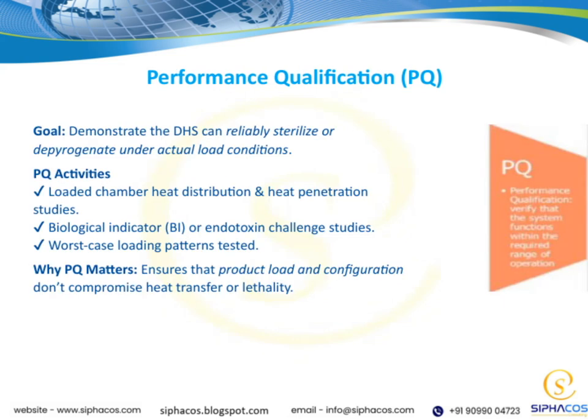Now, let's talk about performance qualification, or PQ. The main goal here is to demonstrate that the DHS can reliably sterilize under actual load conditions. Essentially, we need to confirm that the sterilization process works effectively when it's applied to real-world loads.